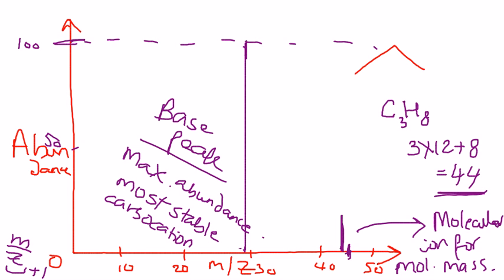So now when you take the molecule and bombard it with an electron and remove an electron, which gives this molecular ionic species, the total electron count now becomes an odd number. At that point, we refer to such ions as radical cations. So the radical cation does have an odd number of electrons. It's important to realize that the molecular ion in a mass spec is always a radical cation.